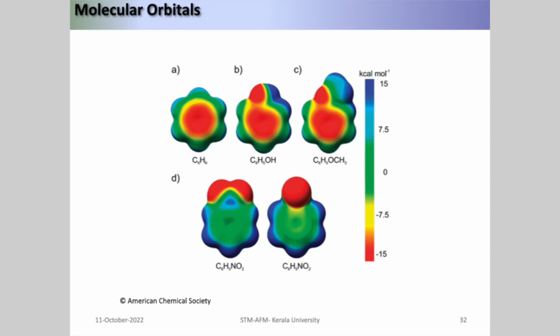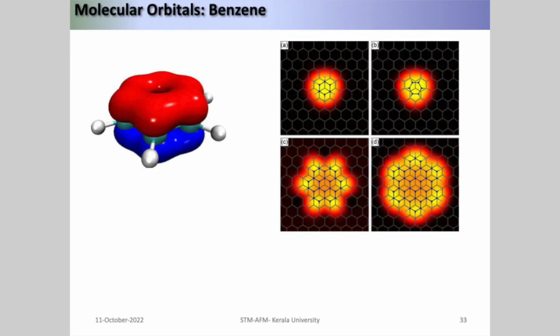So this is how you are going to see, for example, benzene in an STM. You don't see 6 atoms like this. This is the last orbital electrons, how they form the valence orbital, or the HOMO level, of the benzene. And this is the real picture from STM, not the hexagonal one, but this background picture, the yellow and red one. This is if you draw the wave functions of benzene, how the electron cloud looks in benzene. This is how it looks. That's what you see here.